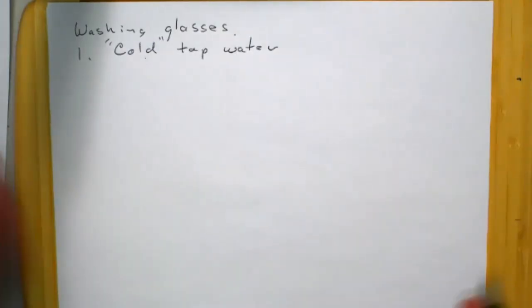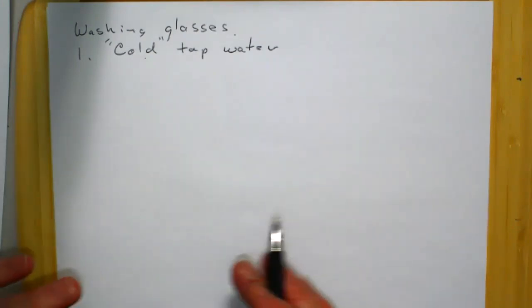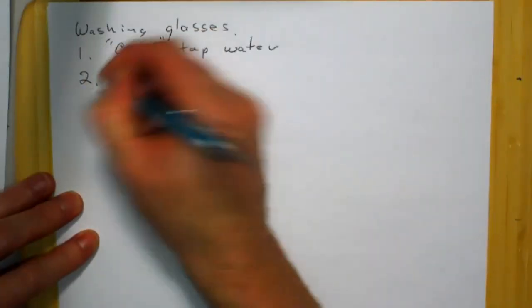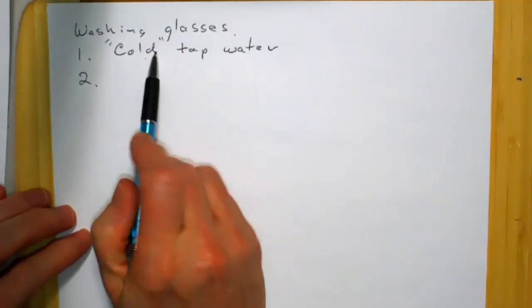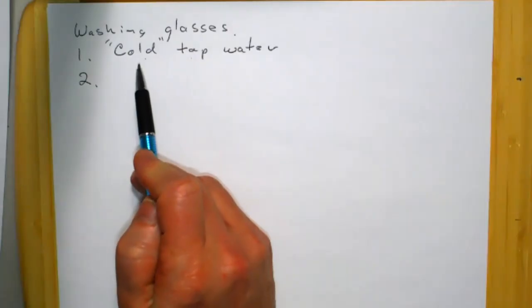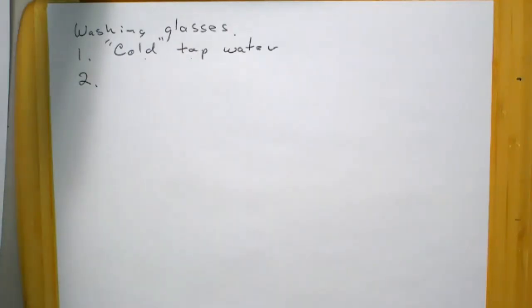Sometimes you'll find some students rather have it hot for washing and then cold for rinsing. Okay, potato, potahto. But you start to see, when I worry about the temperature of the tap water, how much I'm concerned with what contaminants are going in there.